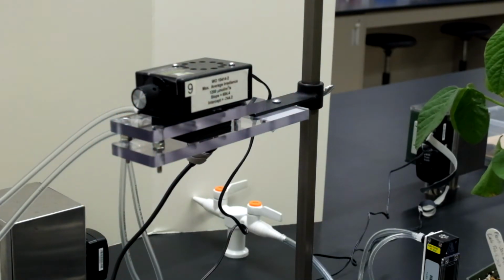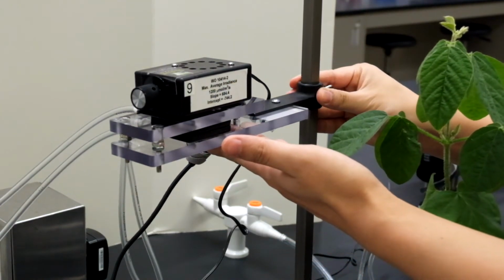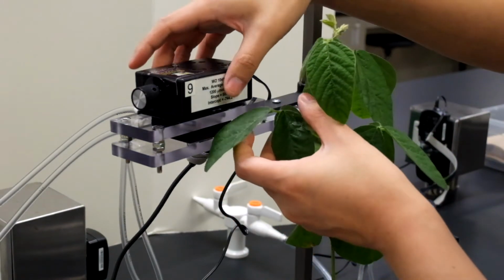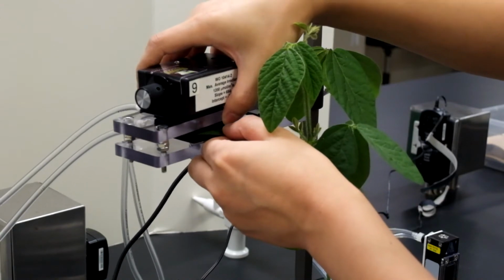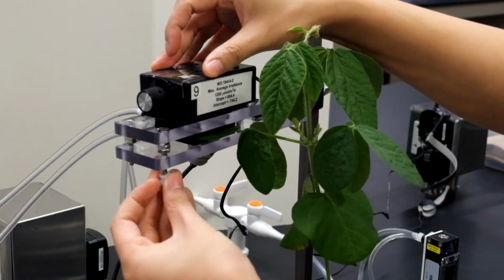So to put our leaf inside the chamber, we want to make sure that the plant is properly adjusted height-wise, either through the gas exchange, the chamber, or the plant itself. That way we're not producing any stress on the plant. So we put our leaf inside the chamber. We want to fill up the entire chamber if possible, close it, and then seal it using all 3 of these screws.